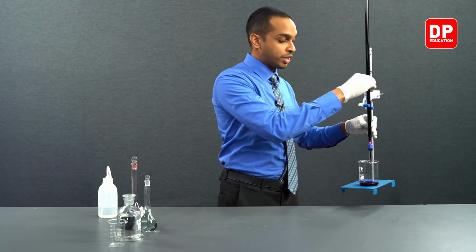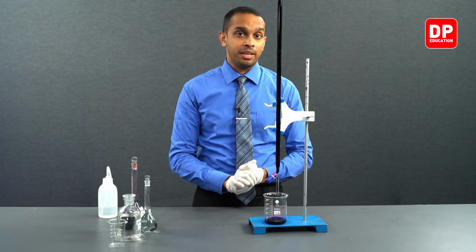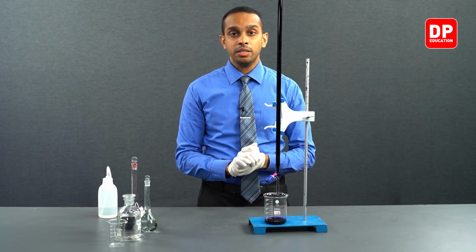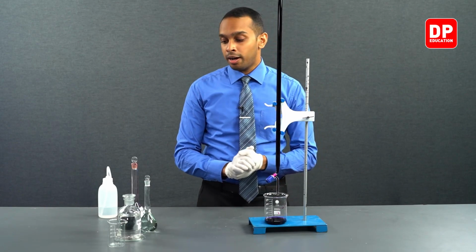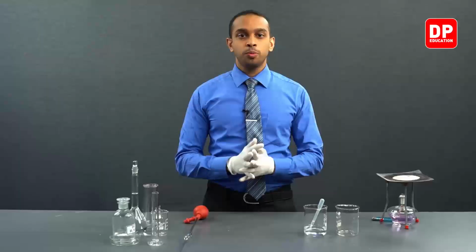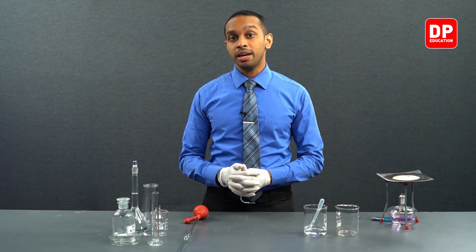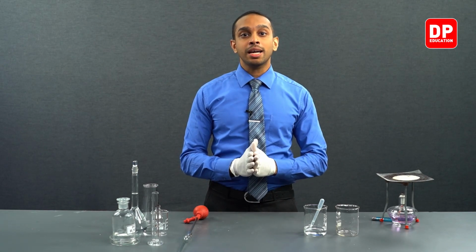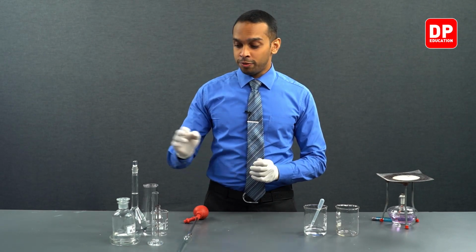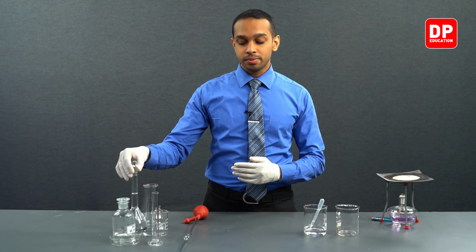We have actually now finished filling up and cleaning the burette. Now the burette is set up for our titrations. Now we will be moving on to filling up our titration flasks to carry out the titration. To prepare the solution that is going to be titrated against the potassium permanganate solution that we have, we need to measure exactly 25.00 cm³ of the potassium oxalate solution that we made earlier.